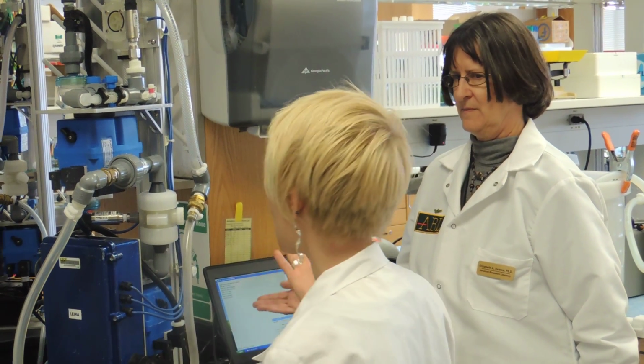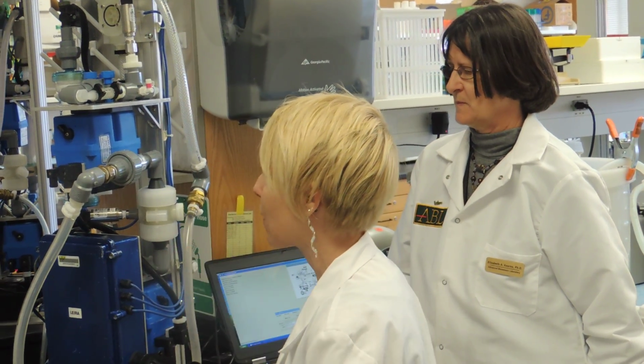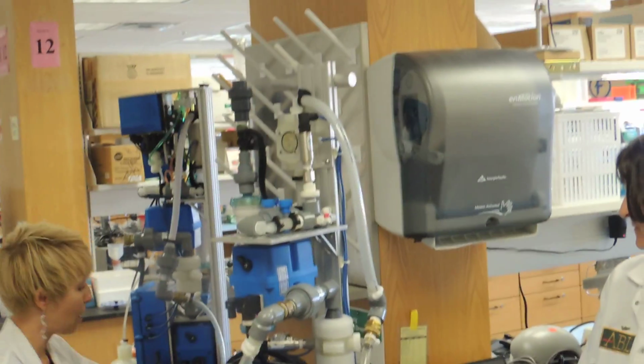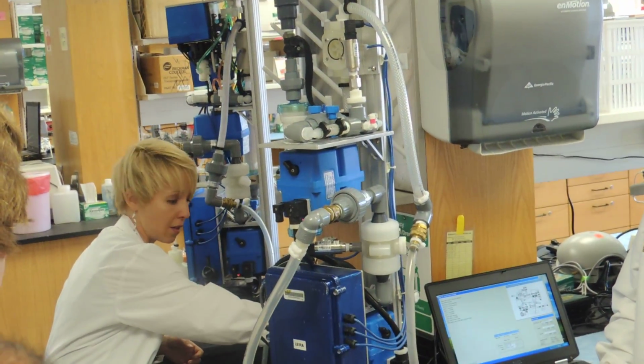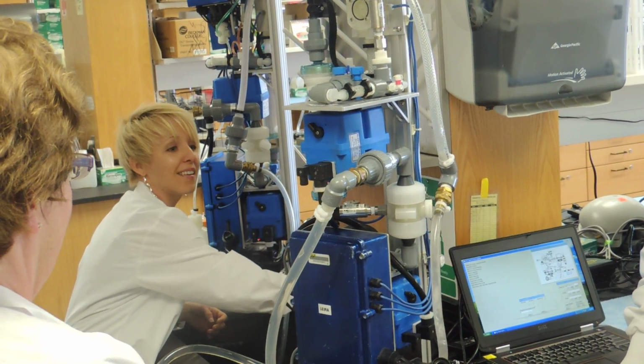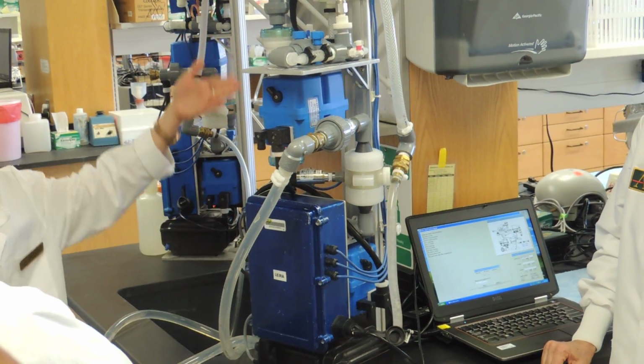Certain amount of time. So once the valves on either side of the filter have been opened, then you can go on to your water source, turn on the flow. That will then start to process through our filter here.